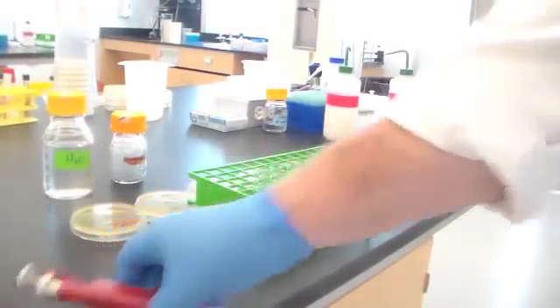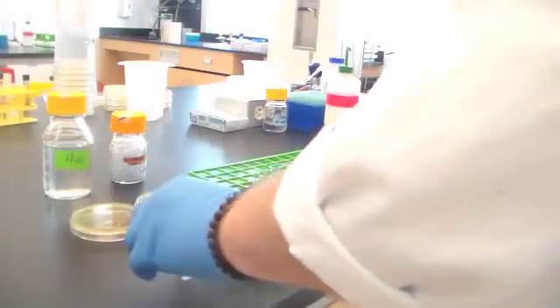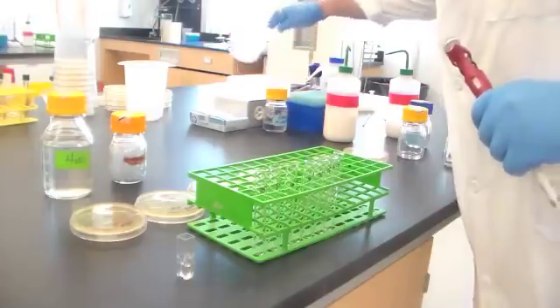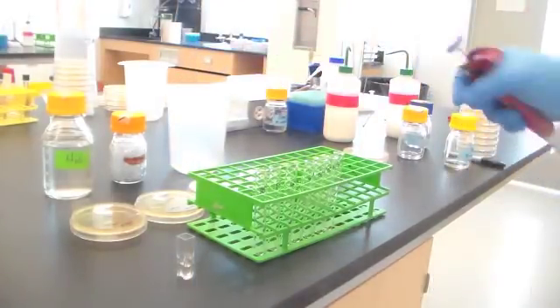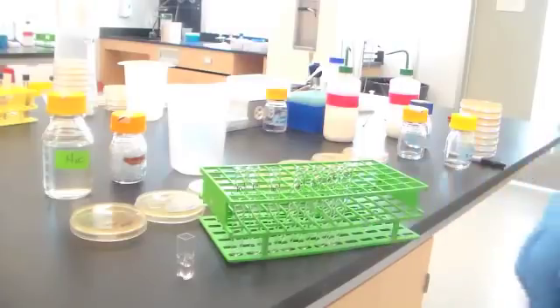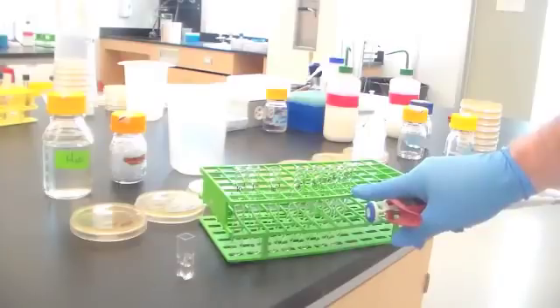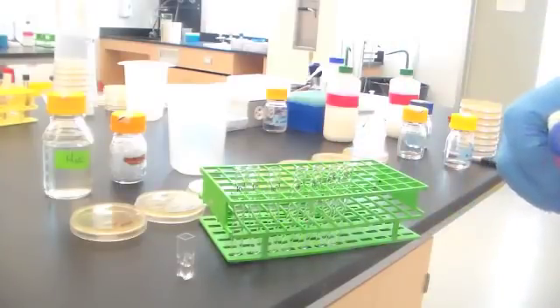So the first thing that you're going to do with this is I'm going to take out the cuvette containing the culture, the 500 microliters of culture that I just used in the spectrophotometer. And I'm going to set up a serial 10-fold dilution. So what I've done is I've taken 7 sterile glass tubes, and I've labeled them 10 to the minus 1 through 10 to the minus 7, reflecting the dilution series that I'm going to do here.